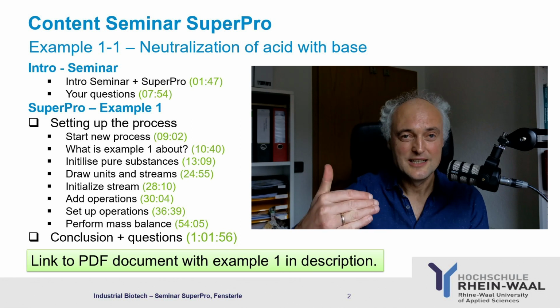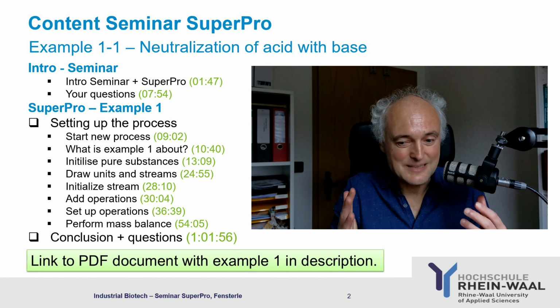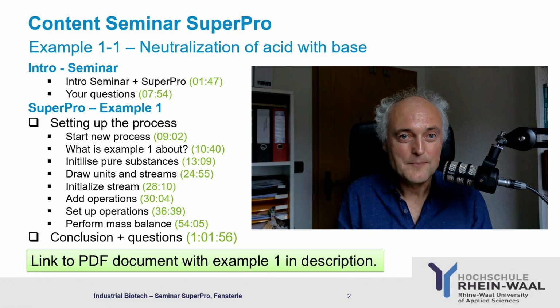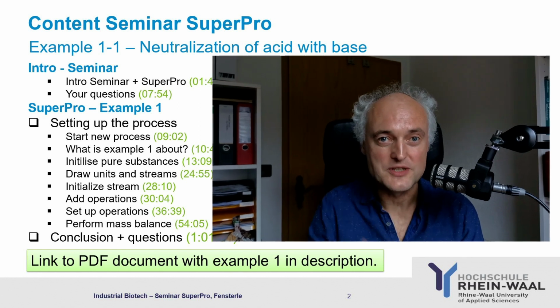At the end, you want to set up a company for the production of a dipeptide. This idea originally comes from our instructors in downstream processing, for example Martin Grehenbrink. They worked in a company called Sysal where they produced these dipeptides. Therefore we decided to set this up based on this company, based on their topic in the company. They have changed to another company. We might also change or adapt the focus of this project.